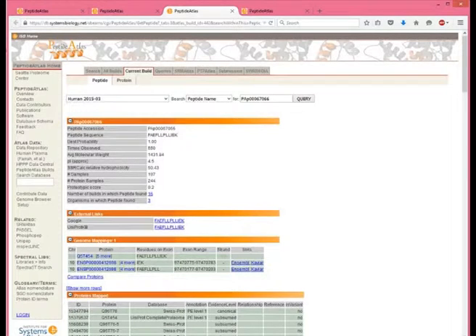You can look at any individual peptide. This particular peptide maps to multiple accessions. You can click this and get a Clustal alignment of them. I will not show that. You can see all the different proteins it maps to down here and whether or not it's a variant mapping. So the one we were looking at before would have shown as a variant for this protein.